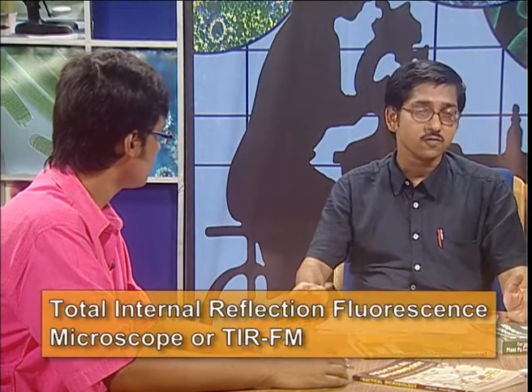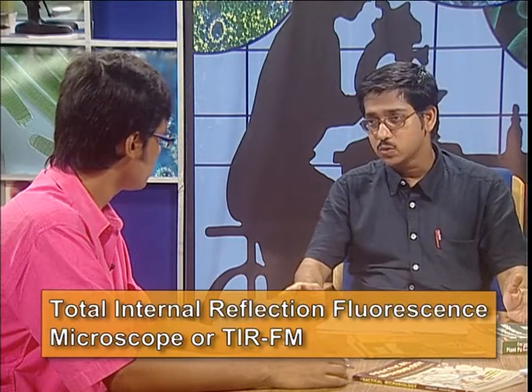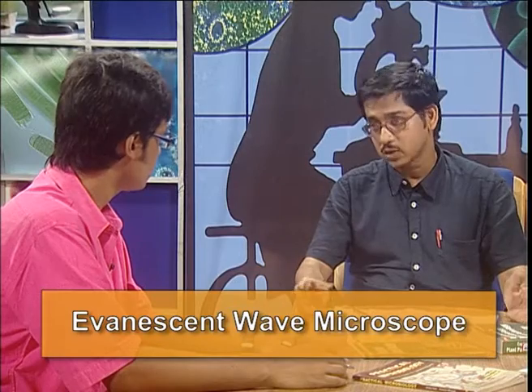However, it has its own fallacies. If we want to see a particular fluorophore at a particular region of the cell, wide field microscope is a major drawback. Now, because of this, different modifications of the fluorescence microscope have been made. The first is TIR-FM, or total internal reflection fluorescence microscope, which is also known as the evanescent wave microscope.